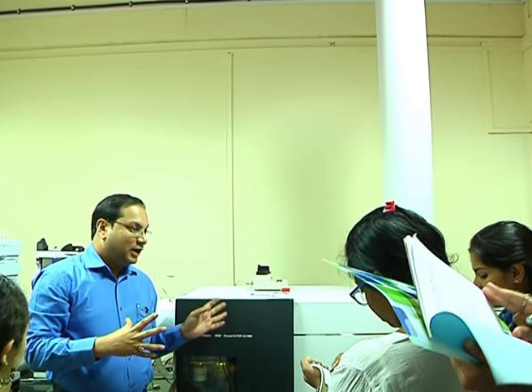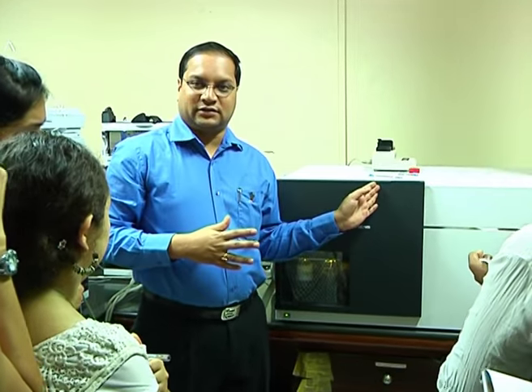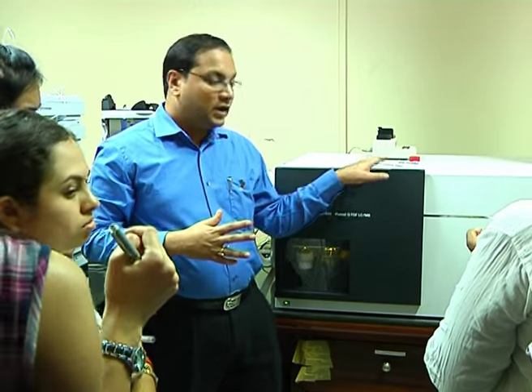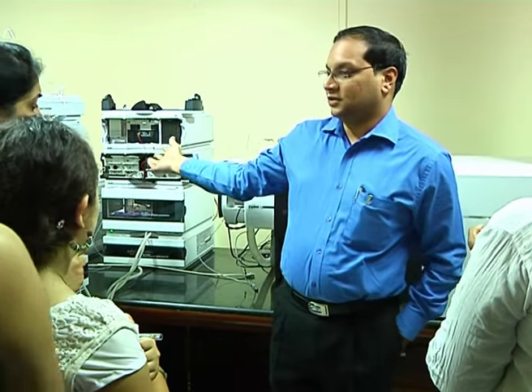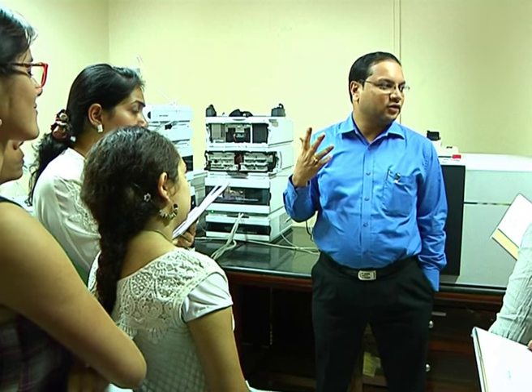Okay, meaning in tandem with respect to doing an MSMS. So there are two different analyzers, quadrupole and time of flight, and that is coupled to an HPLC. That's why we call it an LC-MS, HPLC-MS. So you know there are thousands of proteins in the samples.